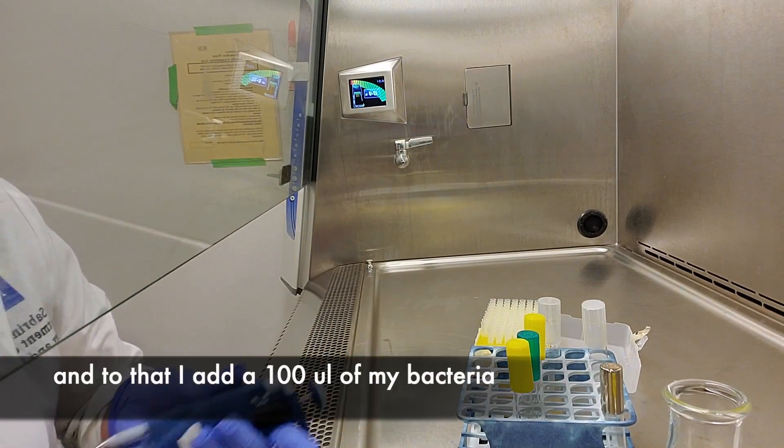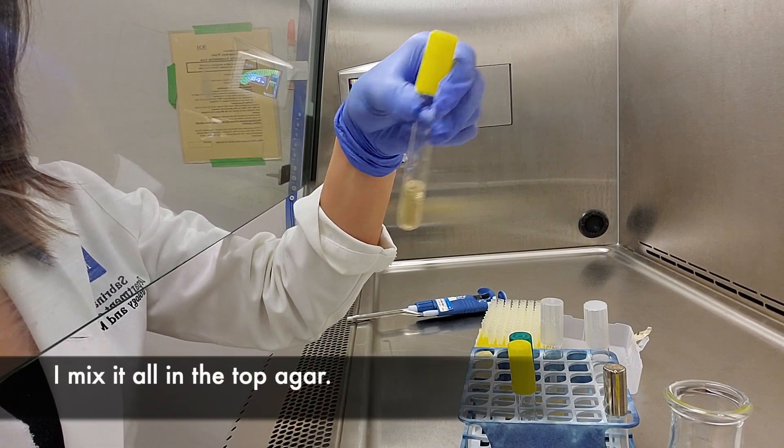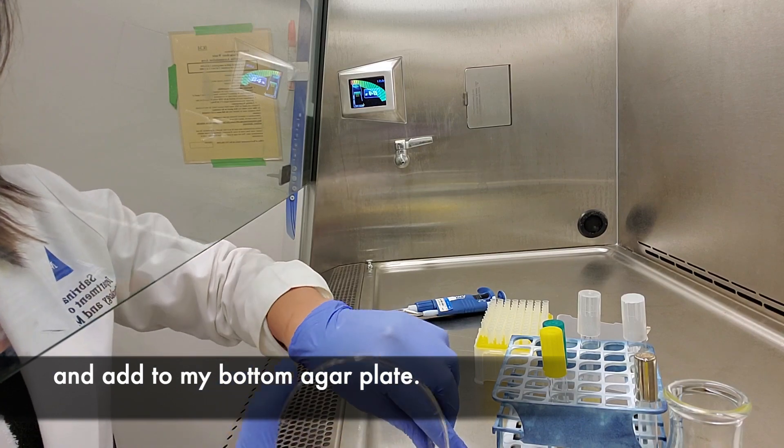To that I add 100 microliters of the bacteria that I want to purify on. I mix it with the top agar and I add it to my bottom agar.